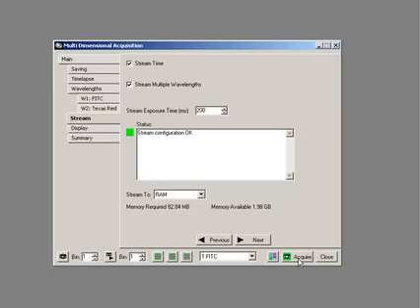All of this data is simply acquired and put into the hard disk, and we can retrieve it later on. Streaming is pretty good to RAM. That's very nice, very flexible.